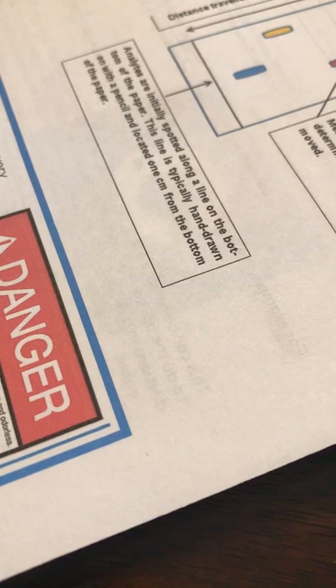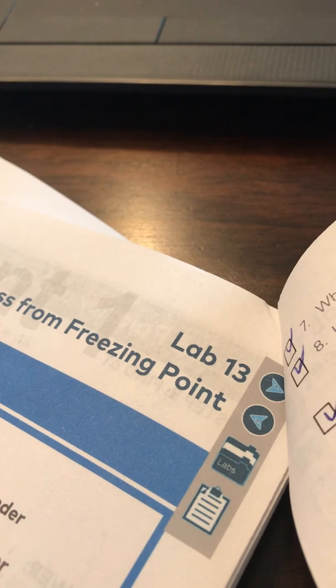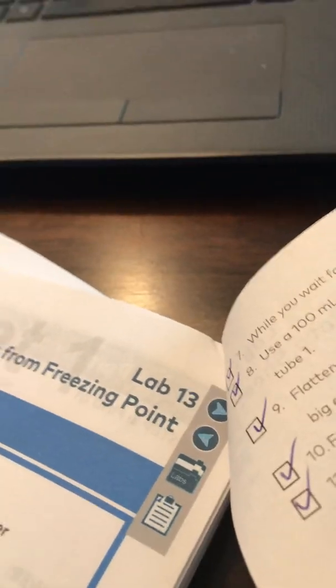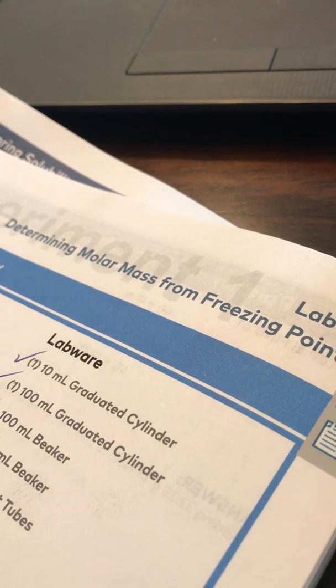That was the first experiment, trying to pull the inks off the papers. The second experiment overview, just flipping pages, determining molar mass from freezing point. So we took 4 different solutions, tried to see when they would start developing ice crystals in a beaker with the test tubes and measuring the temps. So we'll get back to experiment 1, the results.